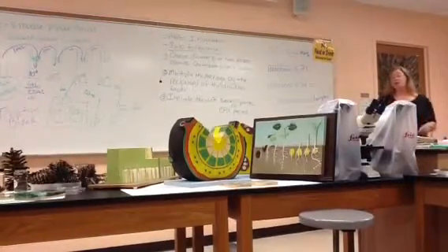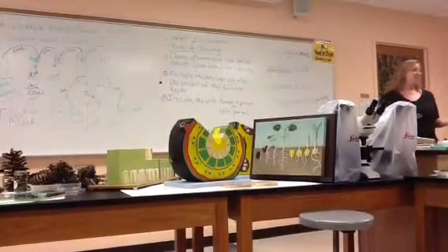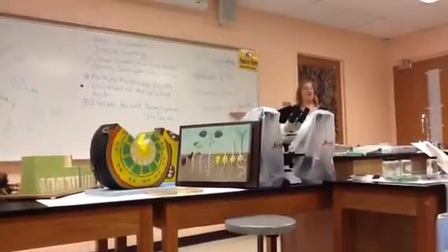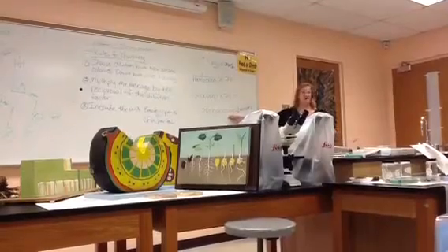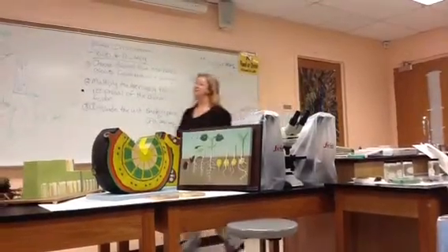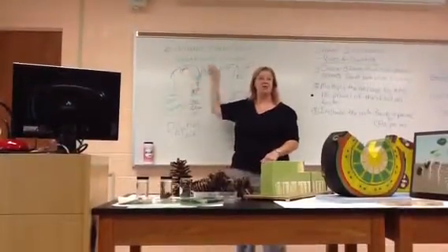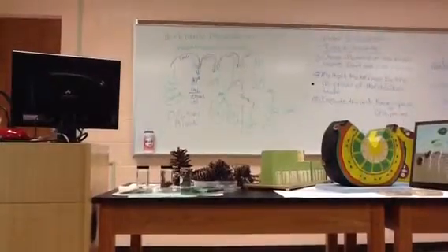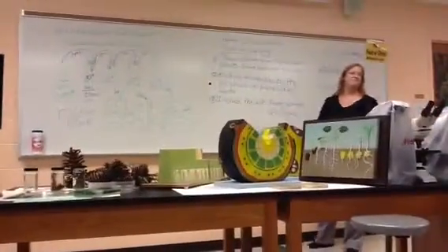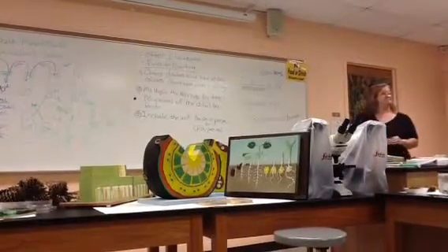If I were to tell you that I had 1 milk, do I have 1 gallon, 1 cup, 1/2 a gallon? How much do I have if I've got 1 milk? You said there were 7,800,000,000 bacteria, does that mean the whole tube? No, it's bacteria per mil, because remember, that's how many you initially pipette out. So you have to put that unit on there or the number means nothing. Okay, so don't forget the unit. That's part of the credit on that kind of question.